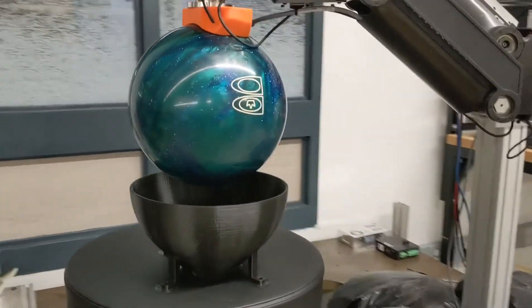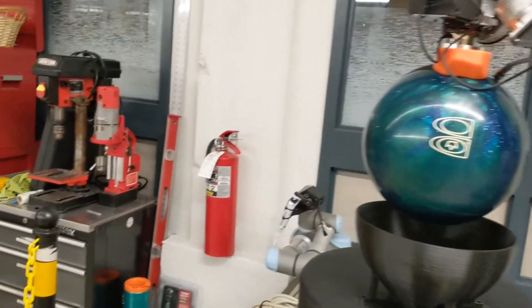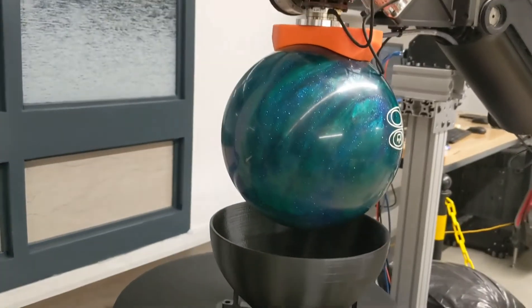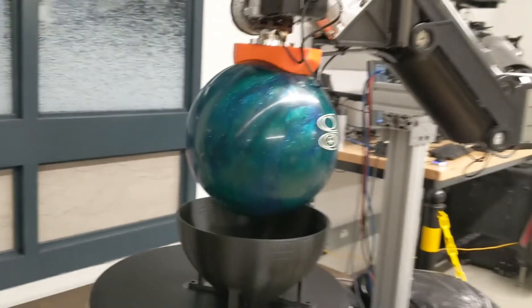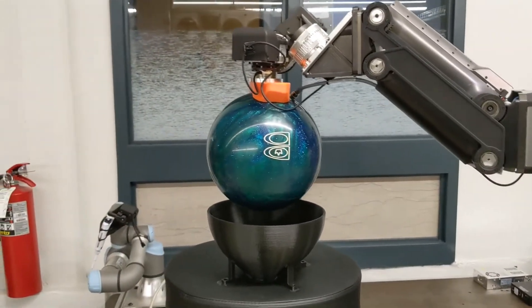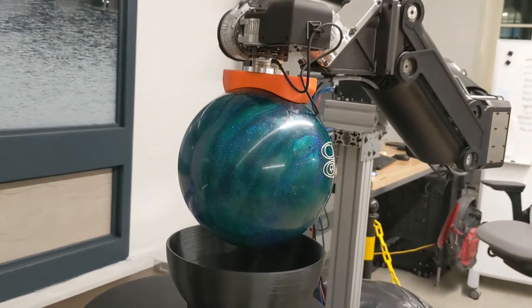And that's going to fit into a corresponding hole. I've chosen a spaghetti noodle and bowling ball just because you kind of understand how heavy they are, how they feel, how fragile they are in the case of the noodle, and how difficult this process is without an augmenting technology like a gantry system or a robot like this. My master's work is going to be exploring collaborative algorithms that will assist operators in this assembly task, trying to make their lives safer and make the process more successful. Thank you.